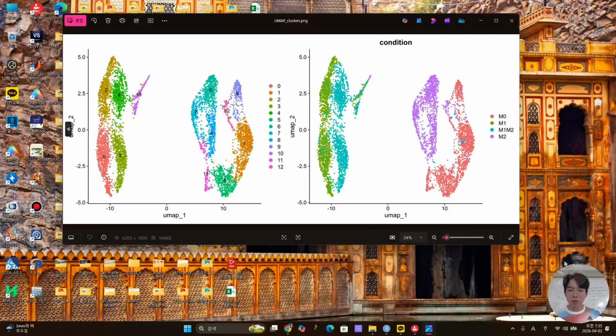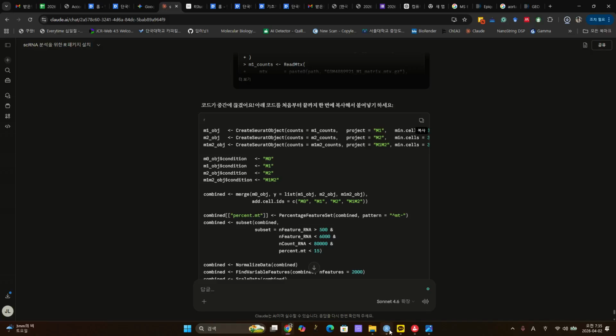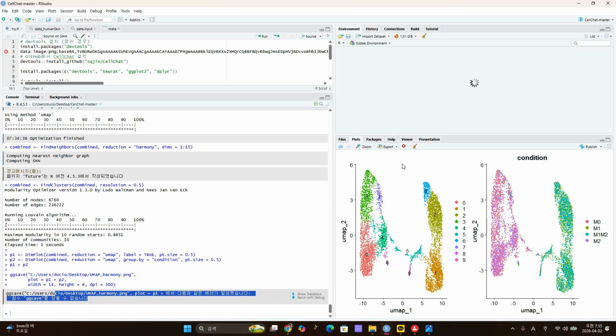Compared to the previous one, this is somehow better, right? I have a little doubt about this. I'll ask them if this is their best.